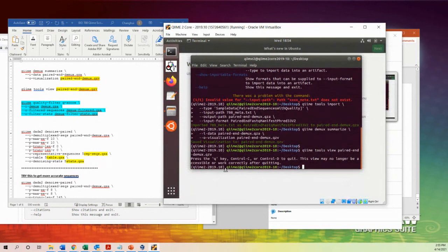If you are running, just don't touch, just leave it there. Then you come back to activate the software after 10 hours, to see if they finish this command or not. If they finish, you should see this green line, so that will tell you they finish. If there's an error, then they will show the red line. Okay, thank you. Good, no problem.